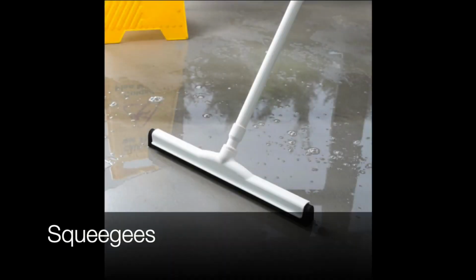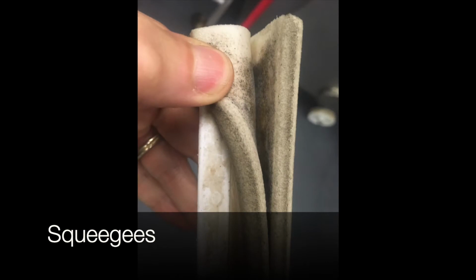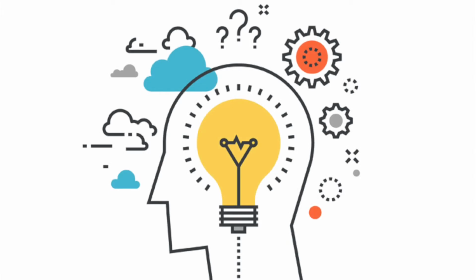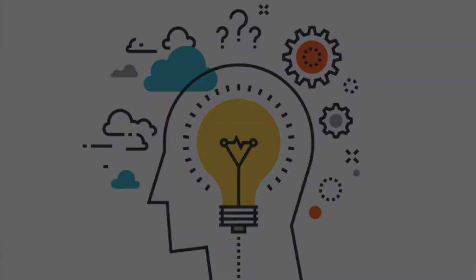Squeegees and other cleaning equipment. Take a look at the squeegees pictured here. Poorly designed squeegees can harbor bacteria in the handle or in the squeegee itself because bacteria can hide in hard-to-clean places. Use common sense to identify other places where Listeria might survive based on knowledge previously outlined in this video.